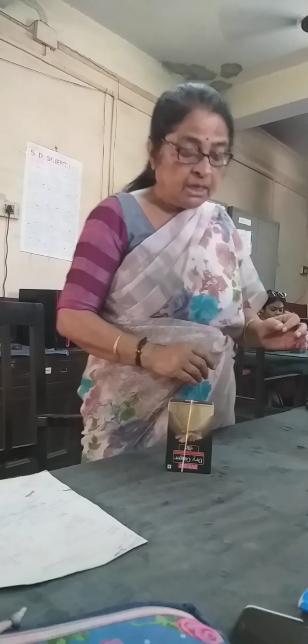Clear? তাহলে আমাকে বলো তো, যে আমি বলেছি যে presence of starch is a unique feature for identification of the rhizomatous drug. They may be simple, they may be complex, they may be compound.